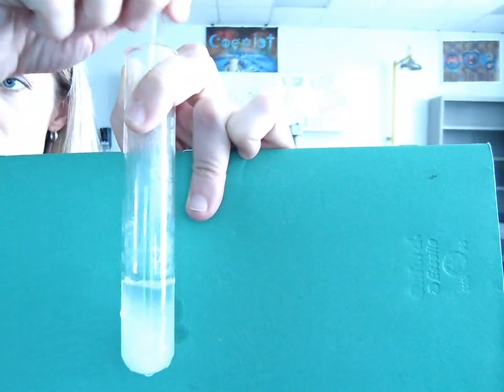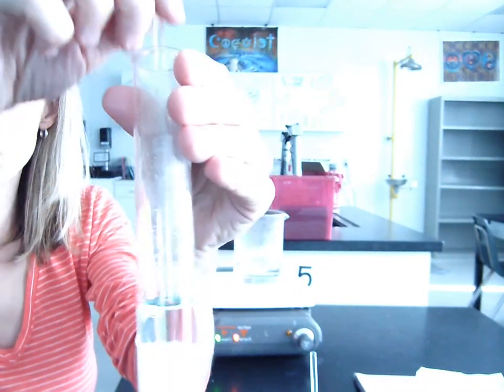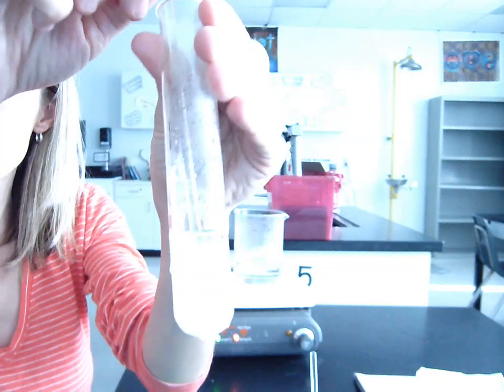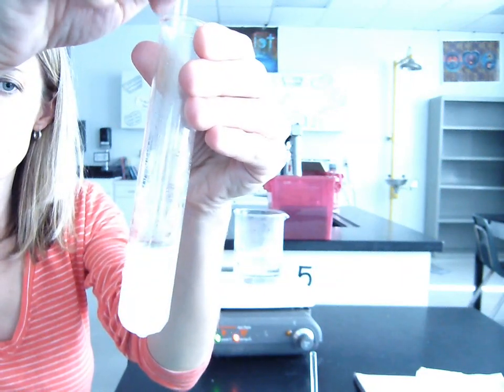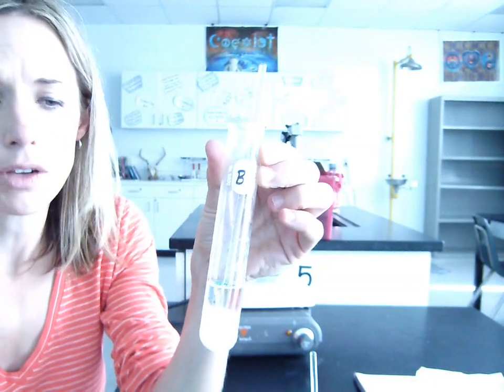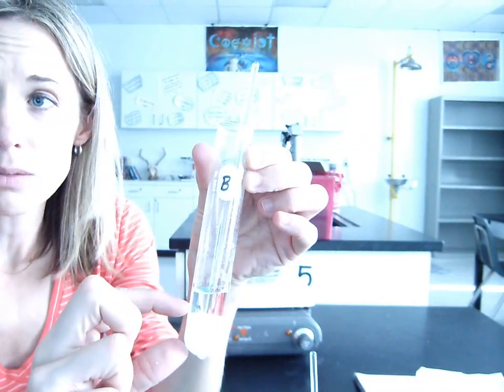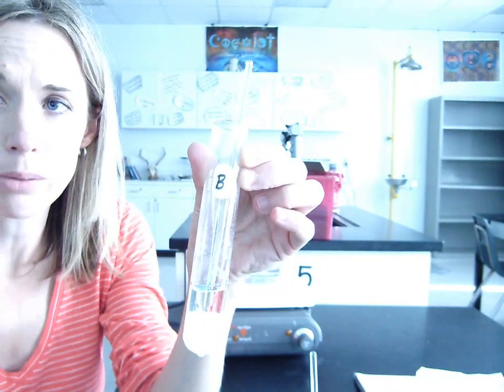It's pretty cool to see it on the camera, but it's much more impressive in person because it actually kind of looks like snow. It looks like little crystals forming in the solution. So what you should notice, if you go back to the beginning of the video, there was about this much solid undissolved in the solution at room temperature.